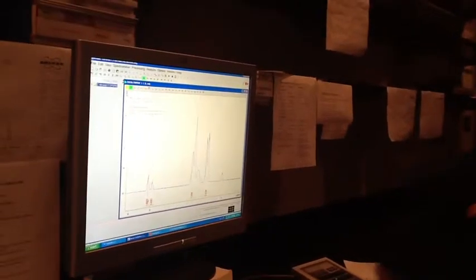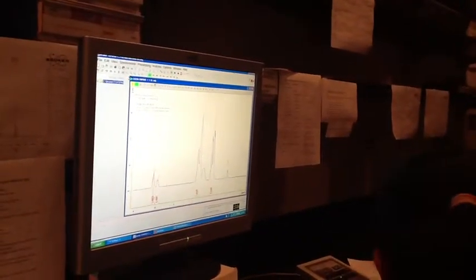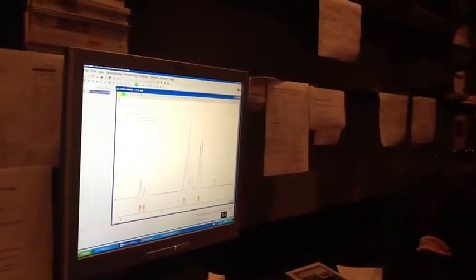If you have the pentanol here, it's in the middle, right? And that integration is 1. The other one with the bromine is, well, I'm sorry I'm drawing on this, but what's the integration for that relative to this? Here, you want a pencil? So we can visualize.